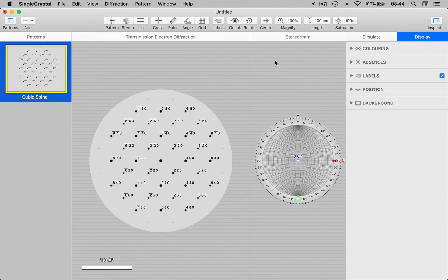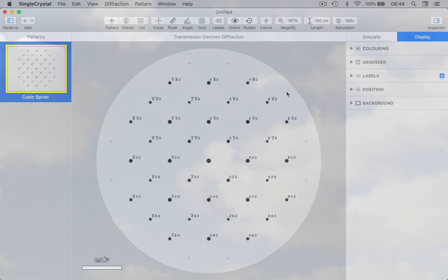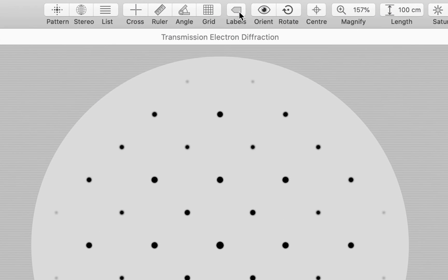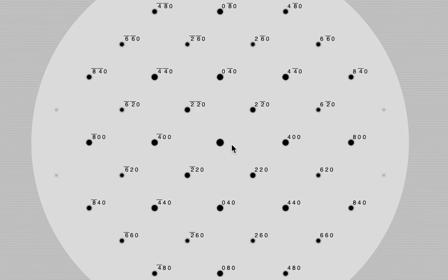On the right-hand side we have a stereographic projection, giving an indication of the orientation of the crystal. I'm going to hide this for the moment so we have more space, and let's zoom in a little. You can toggle reflection labels on or off by clicking the Labels button in the toolbar. The reflection at the centre is 000, corresponding to our straight-through beam. Notice that quite a few reflections are missing — we go straight from 000 to 400 to 800 and so on. These missing reflections are called systematic absences.